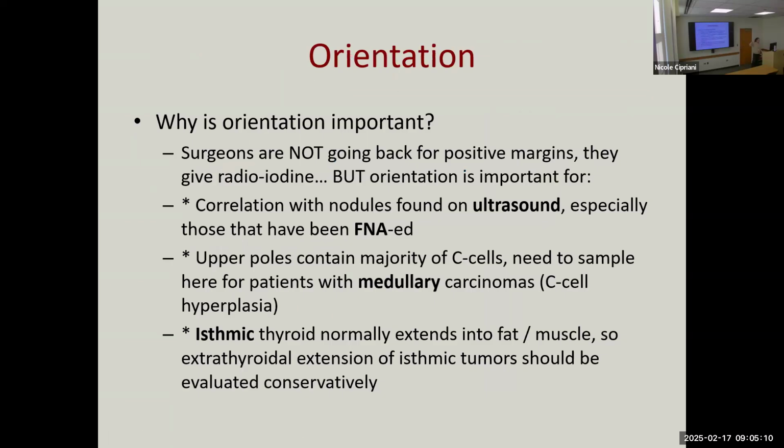Okay, I did want to mention a couple things about grossing, if you have 2 minutes, because we want you to always correlate what you're doing with nodules that were seen on ultrasound and nodules that were FNA'd, because we need to tell them the diagnosis of the nodule that they were concerned about. So if there's a nodule of clinical concern, we want to make sure we got it.